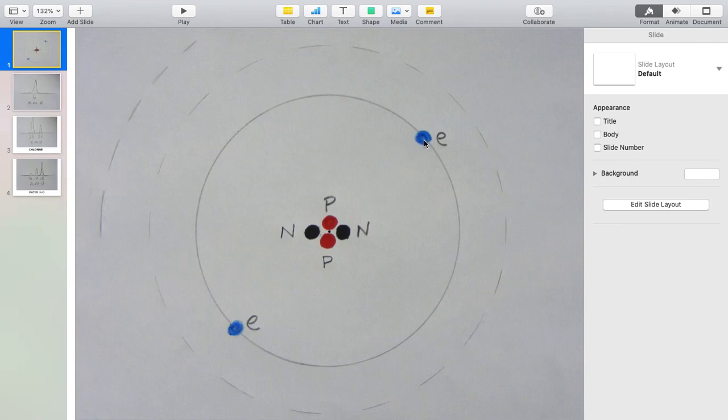So once it's lost an electron, it's then unbalanced and it's positively charged, and so then the atom or molecule can be accelerated in an electric field, and then when it's moving due to this acceleration, it can have other forces applied to it, and the way it moves will show how heavy it is. In a traditional mass spectrometer, this is done with a magnetic field, and this is the simplest type of mass spectrometer to understand.